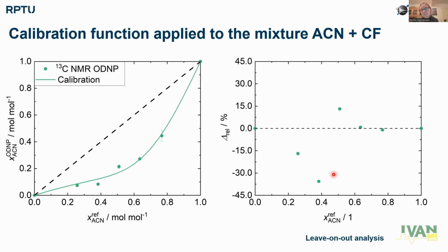And then you end up with errors, which I'm not yet confident with, but I think most of the bad quantification relies on our stupid setup with that sudden expansion to the 3 millimeter and the bad flow dynamics that we have here. But at least now we can measure carbon-13 under continuous flow, which we couldn't do before, and we have found a way to quantify that.